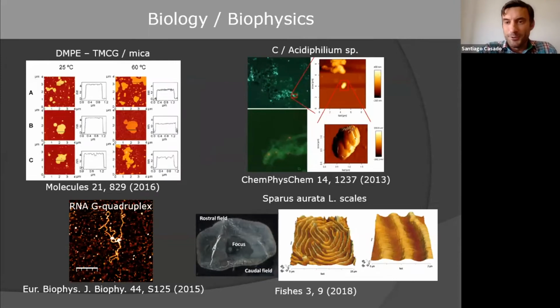And also we can see what nature has done. This is an experiment in which we look for differences in a bilayer. We deposit a bilayer of lipids, and we saw how it is affected by proteins, and how it is affected by other molecules that can be incorporated inside, for example, catechins or cholesterol. There's a change in the bilayer, of course, and we can explore this modification by using the AFM in a liquid medium, of course.